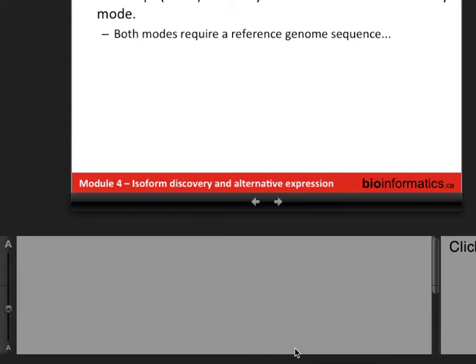We're going to use Cufflinks in what's sometimes called a reference annotation based transcript assembly mode, or RABT mode, and also a de novo assembly mode. So far we've been running Cufflinks with a GTF file that provides an idea of what the transcriptome already looks like, and we've been basically asking Cufflinks to take that model of the transcriptome very seriously and to estimate expression for the transcripts described in that GTF file.